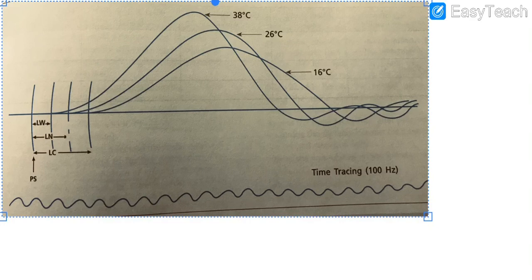That is the mechanical. This blue line depicts the mechanical events, but we have provided the stimulus at this point. The first dashed line is the point of application of the stimulus. And this red line depicts the action potential generated in the muscle. So, this is the depolarization phase and this is the repolarization phase. Depolarization and repolarization are the action potential, the electrical events, and this blue line, the simple muscle twitch, is the mechanical event.